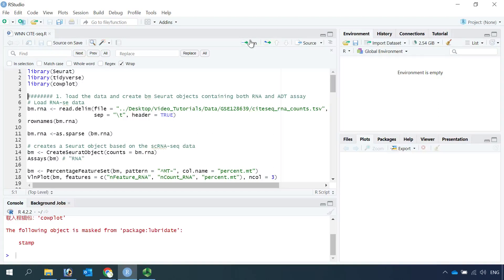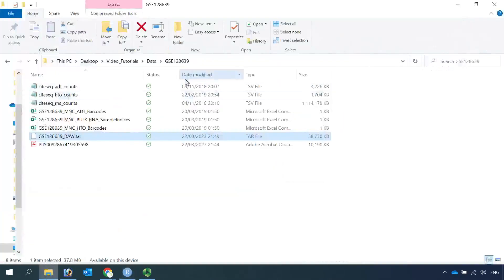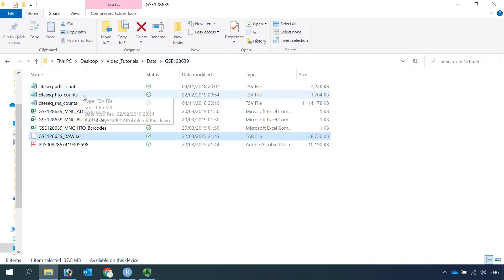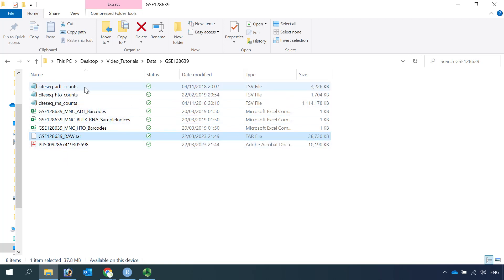We are going to use data generated from bone marrow samples. You can download the data from the GSE128639 dataset. I've already downloaded it. You just need the ADT count and the RNA count for today's analysis.